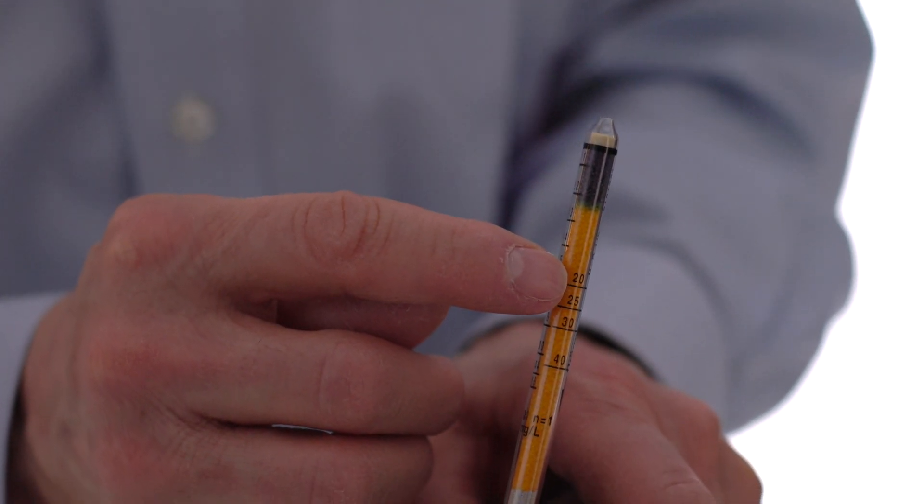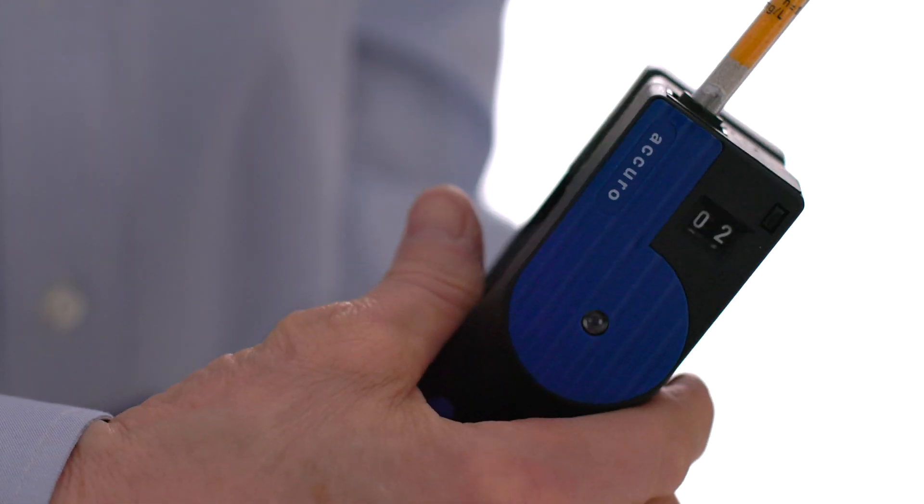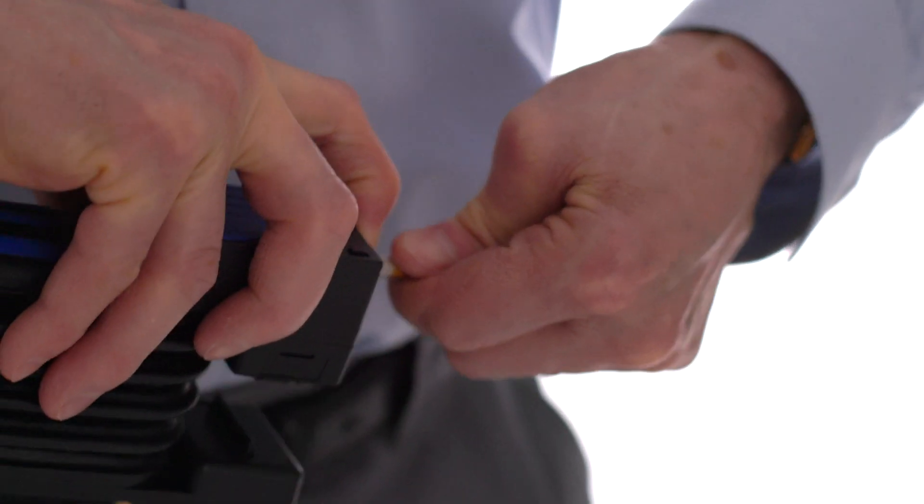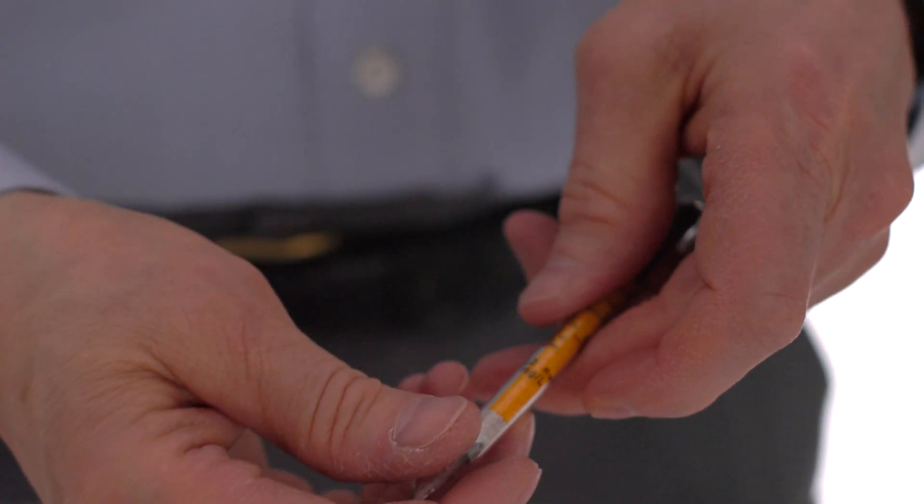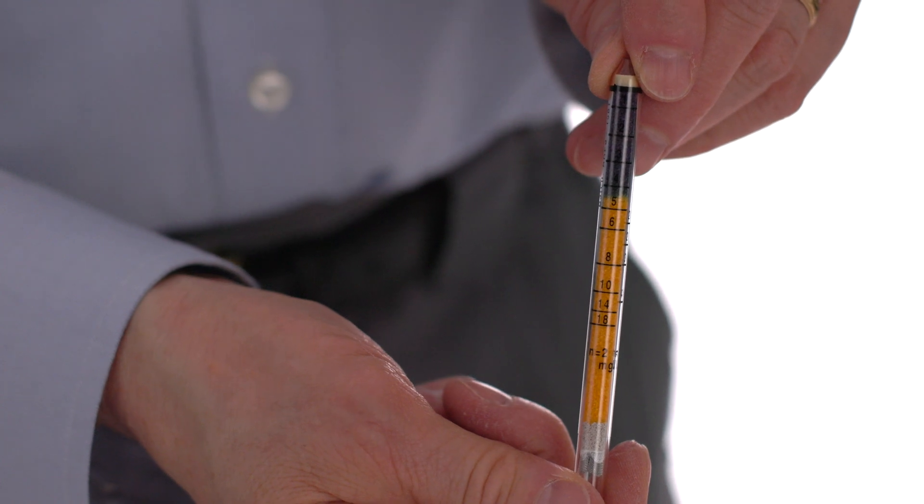The discoloration did not reach the high range scale. Therefore, we need one additional stroke. Remove the tube and read the discoloration immediately. You can see this reading is about 5.5 milligrams per liter.